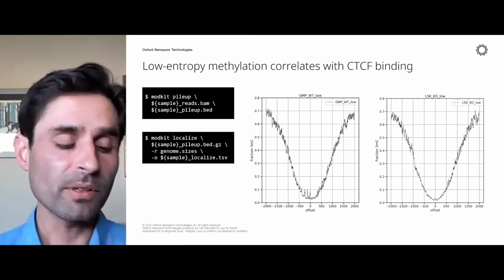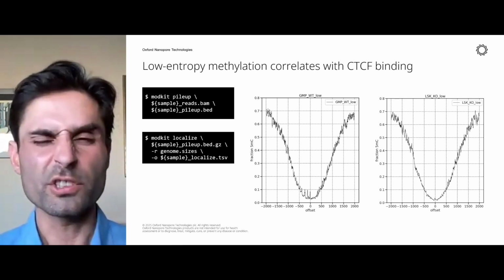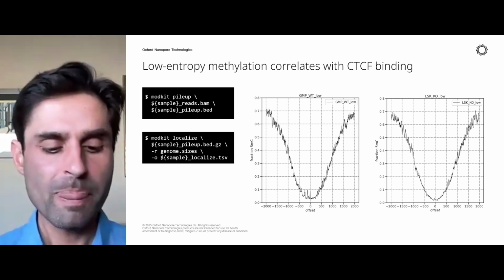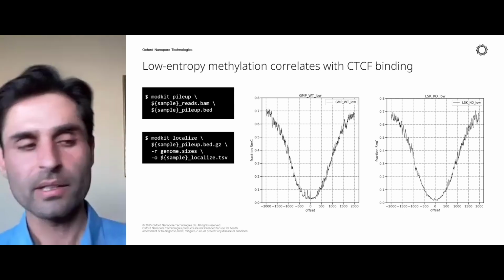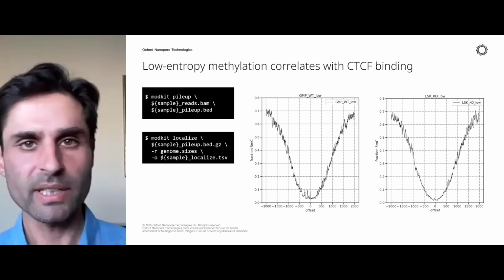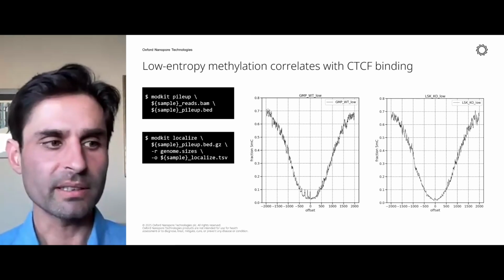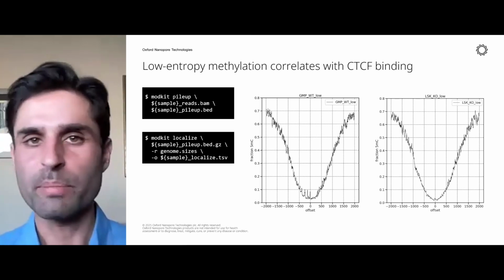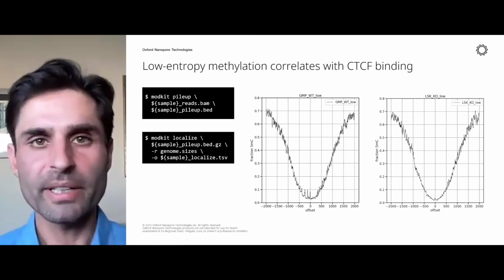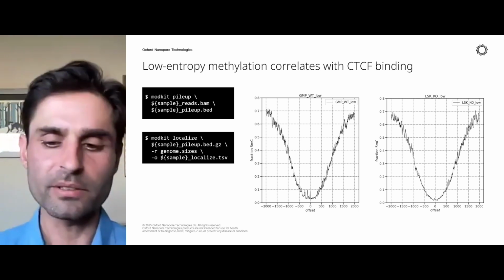And I like to tell people that this, combined with something like bedtools, which is a genome arithmetic program, lets you say, okay, I want to look at these sites but take these other ones out, look at a pattern, internalize that in your head, maybe manipulate it a little bit or do an outer join or something, and go do that again. You start to find these patterns just by iterating on them and looking at them. And so the idea is that this makes that easier to do.